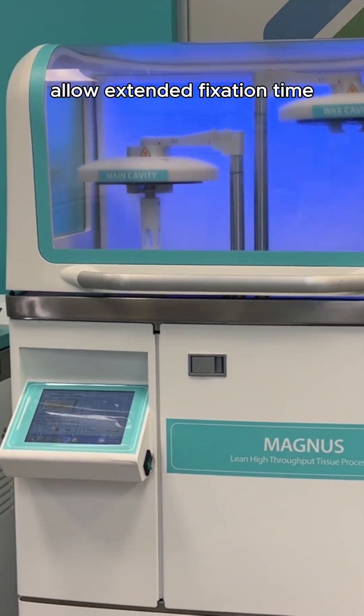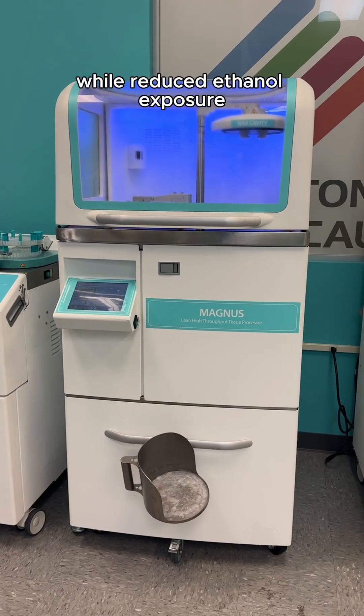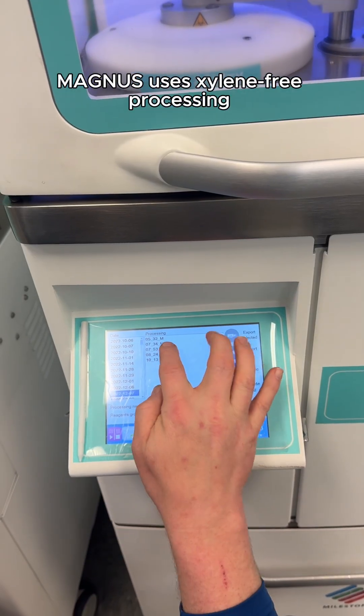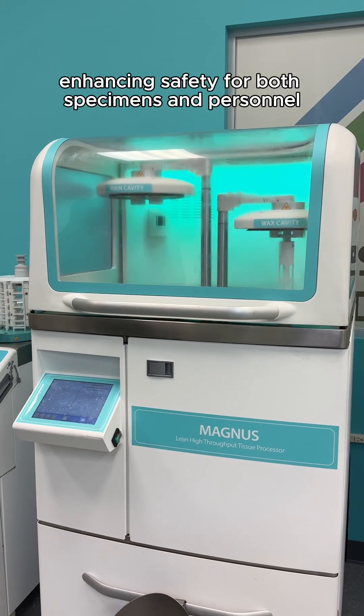Shorter processing protocols allow extended fixation time for improved formalin penetration, while reduced ethanol exposure helps prevent over-dehydration. Magnus uses xylene-free processing with ethanol and isopropanol, enhancing safety for both specimens and personnel.